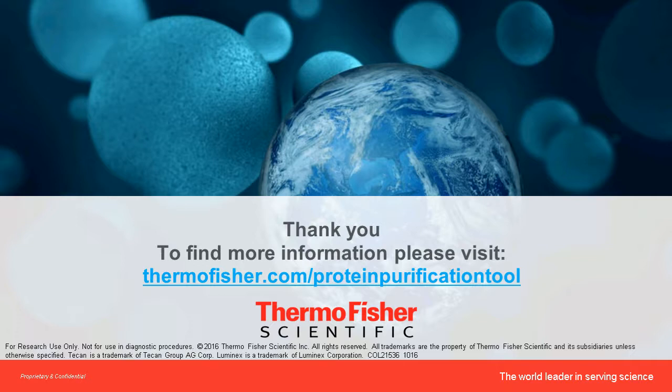Doing so, a lot of times for low abundant targets, your recovery is pretty much zero. You don't enrich any low abundant targets because cross-linkers somehow bind to or mask the epitope binding site of the antibody for that antigen. So the protocol we came up with is, you let the antigen-antibody complex form, and then you bring in the beads for minimum time. So you capture all the antigen-antibody complex with the minimum non-specific binding.